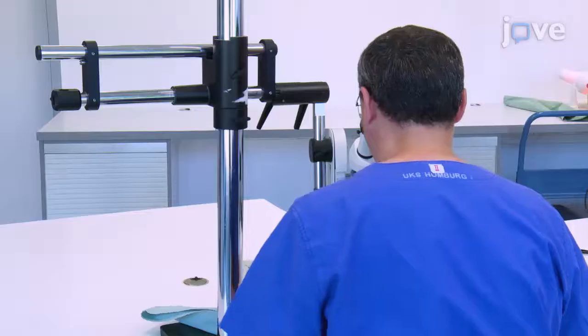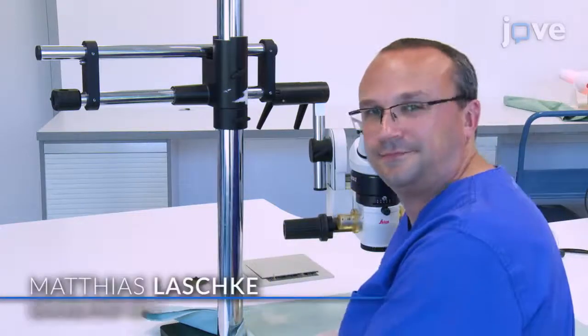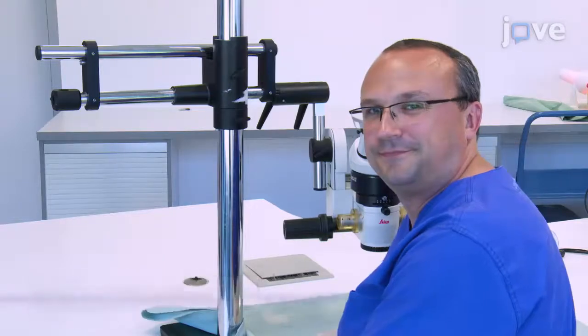Demonstration of the procedures will be done by Dr. Matthias Laschke, a surgeon and professor from the Institute of Clinical and Experimental Surgery.